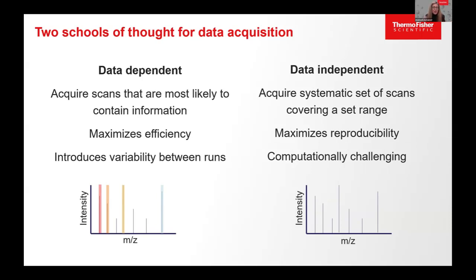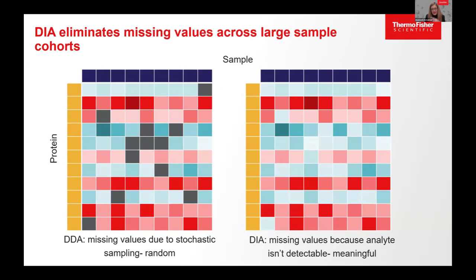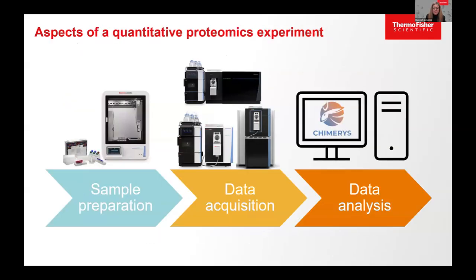Some things that we always thought, oh, we need a DDA spectra or MS2 to see if this peptide is from that proteoform or not. There are tools being developed even for DIA nowadays to look at the proteoform from a bottom-up approach like DIA. And that is the value that I see. And this, like the cartoon says as well, is how with the DIA acquisition method, you can improve the quantification because of the data completeness.